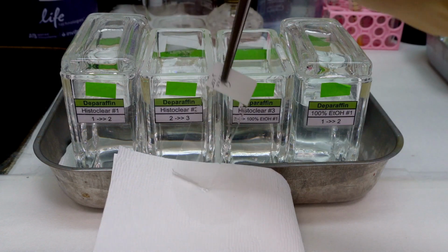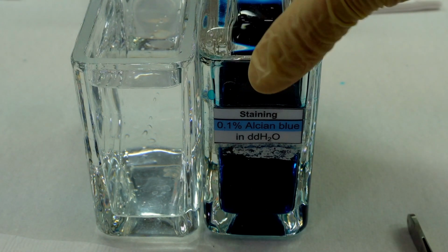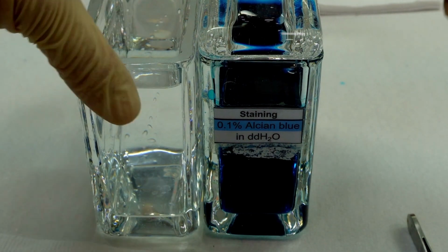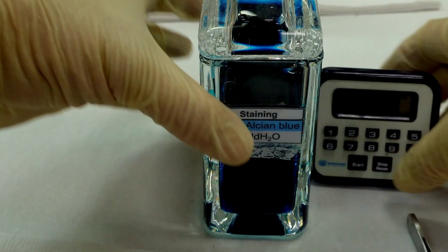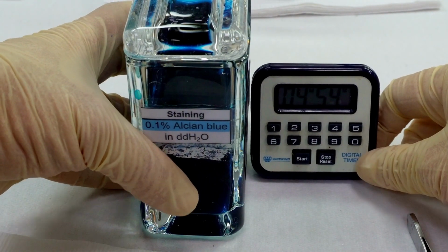Now for the staining. Interestingly, the protocol described actually starts with a stain called Alcian blue. Alcian blue. What does that show? It specifically stains acidic mucopolysaccharides. These are important components in things like cartilage matrix, some connective tissues. So it highlights those specific components in blue. Exactly, giving them a distinct signature.